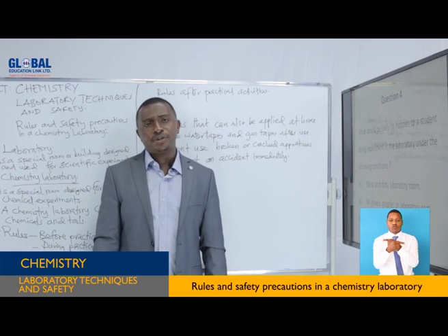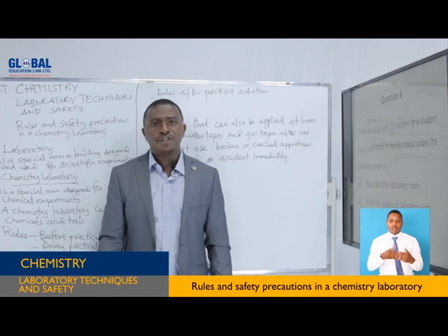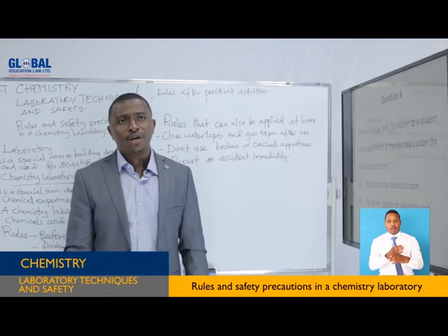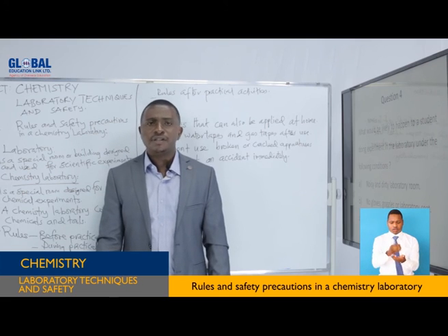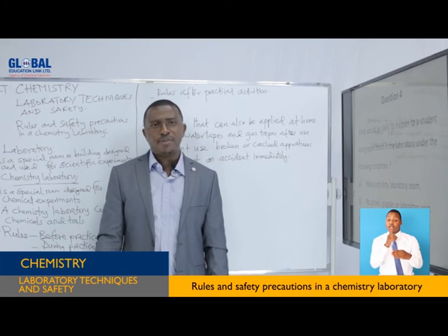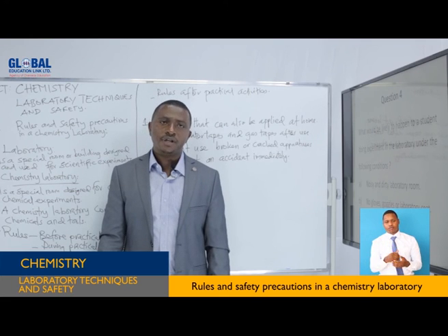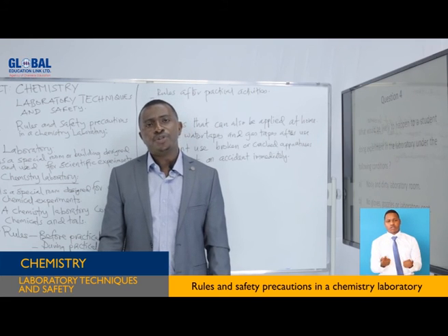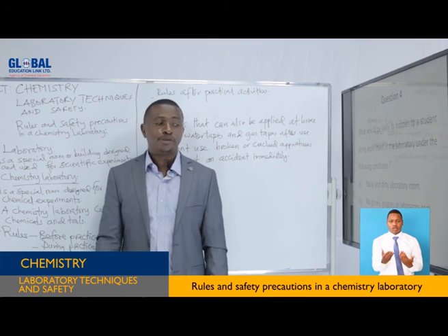But a dirty laboratory, let's say you are working in a laboratory with a lot of dust, a lot of spilled liquids, and a lot of broken glasses. This is very dangerous, working in a dirty laboratory room. It's because the dust can contaminate your chemicals. The dust can make you not get proper answers for your conducted experiments.